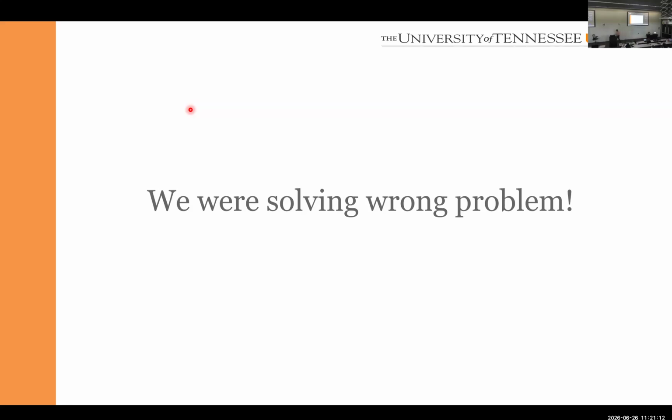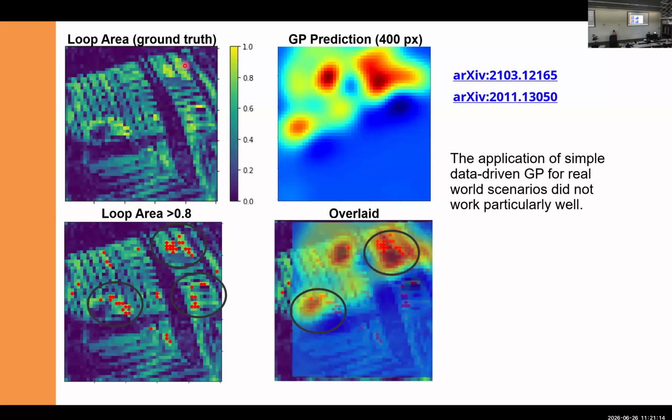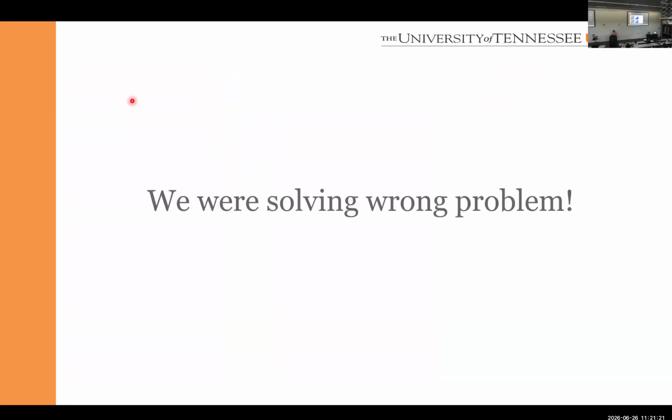If we try to use the Gaussian process over the space like this, you see there are a lot of small details here, right? So the small detail practically means that the kernel length has become very small. If the kernel length is small, then there is no advantage of Gaussian process active learning compared to the grid-based measurement. There is just none. In fact, it's more complicated because a normal microscope scan like this is a very effective scan pattern. It's easy to realize.